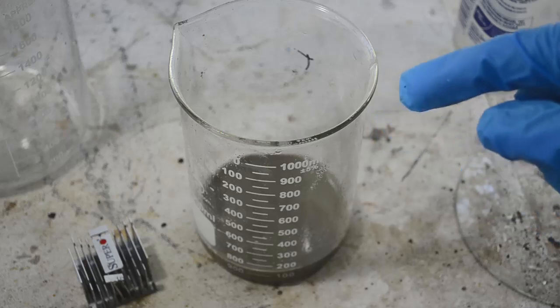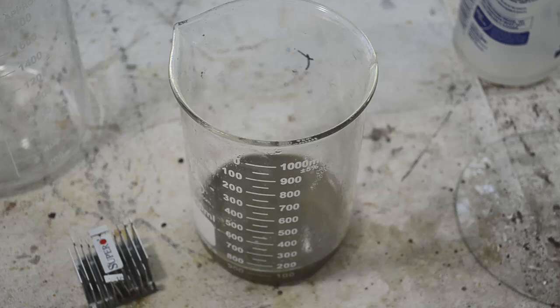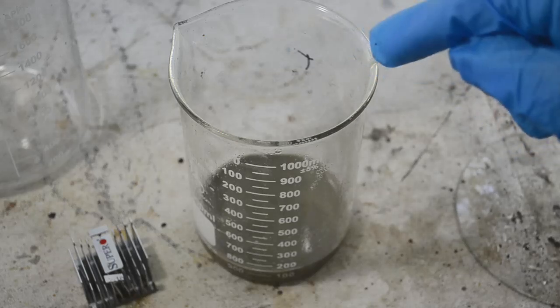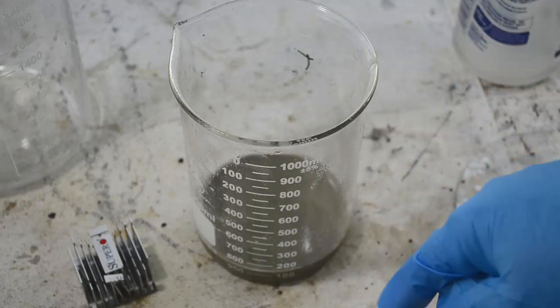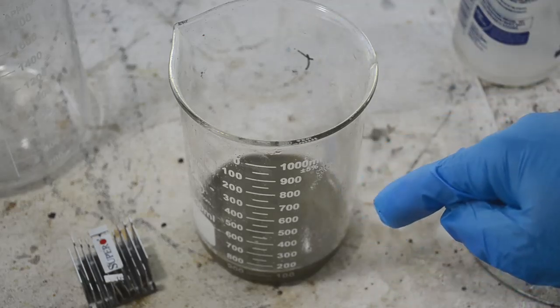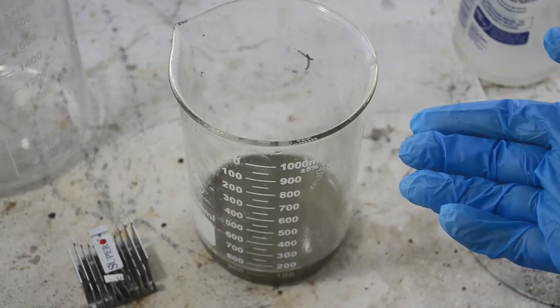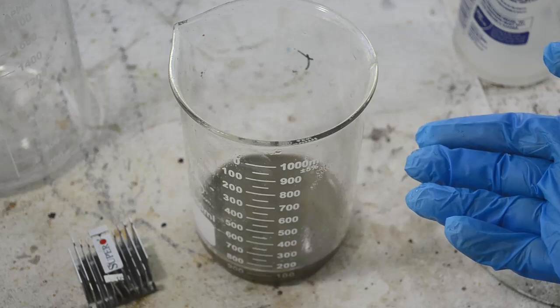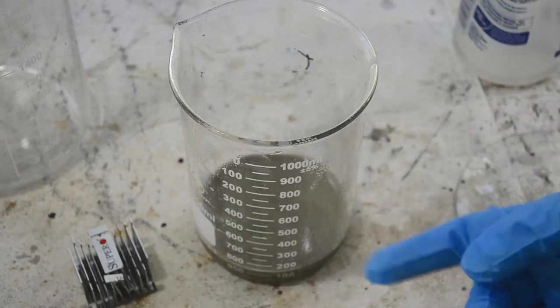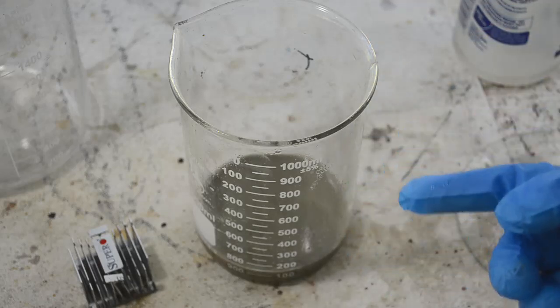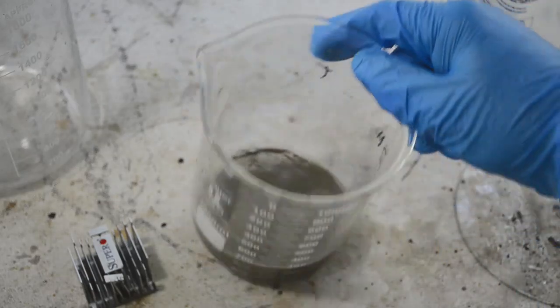When the aluminum and the silver chloride in solution come together, the aluminum is going to steal the chlorine from the silver chloride because aluminum is a much more reactive metal than silver. The one thing that is more insoluble in water than silver chloride is silver metal. So when that happens, silver metal drops out of solution and stays out. And now there's room in the water for more silver chloride to dissolve and keep that equilibrium up where it wants to be. The reaction just keeps going until all of the silver chloride has been converted into silver metal.